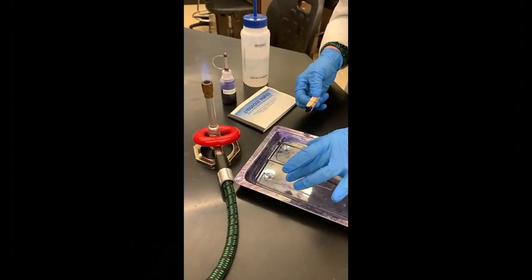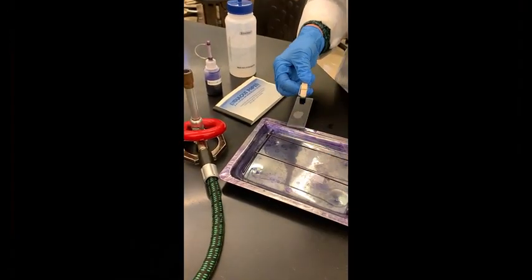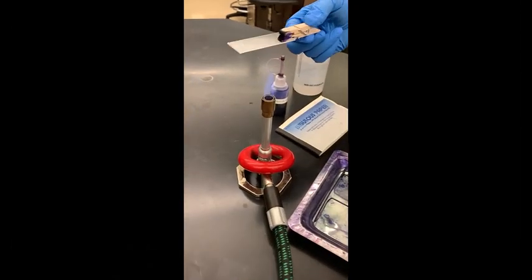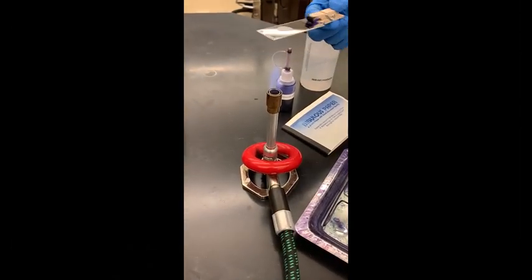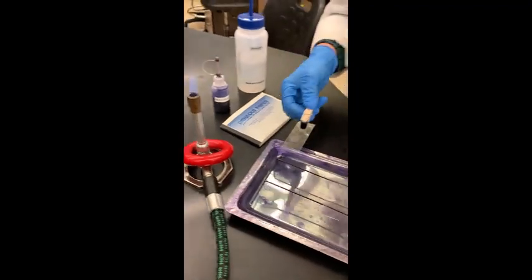Next, you're going to heat fix that smear by passing the underside of the slide through a Bunsen burner flame a few times. This is the step that really takes some practice.